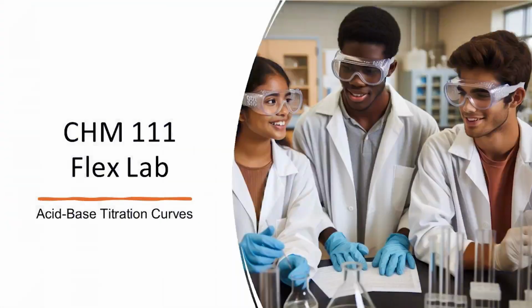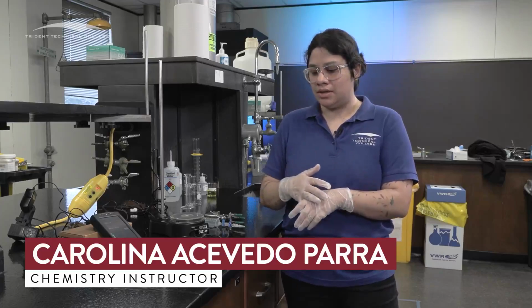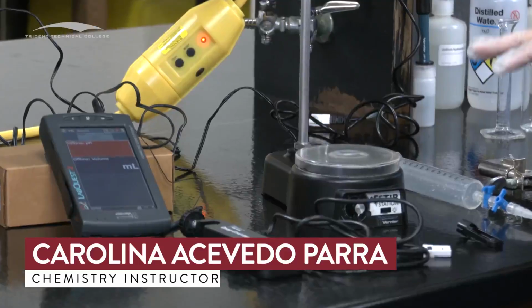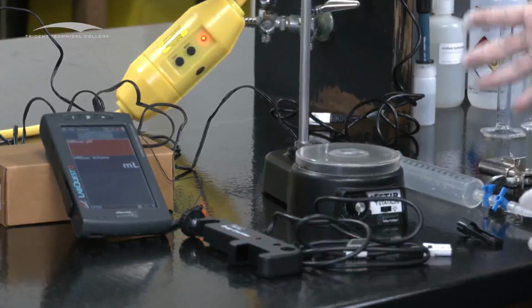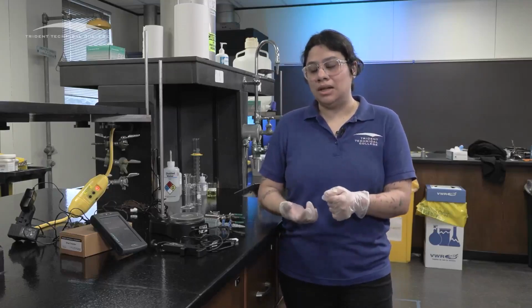So welcome students for this acid-base titration lab. What we're gonna do is talk about titration curves. You're gonna do a strong acid, strong base titration, and then you're gonna do a weak base, strong acid titration. You're gonna need a couple of materials for this, and the first thing I'm gonna show you is how to calibrate, which is probably the most important part of this lab, and probably what's gonna take you the longest.